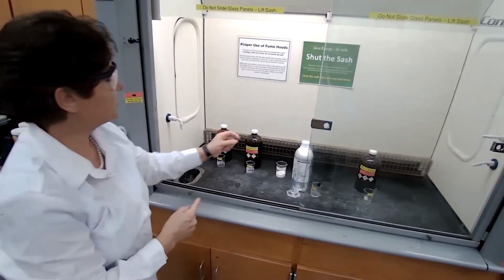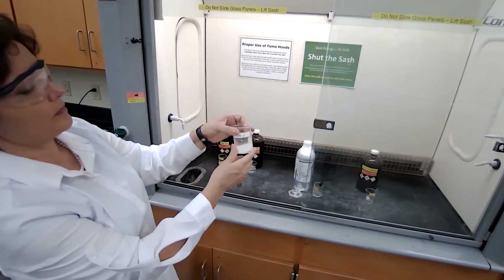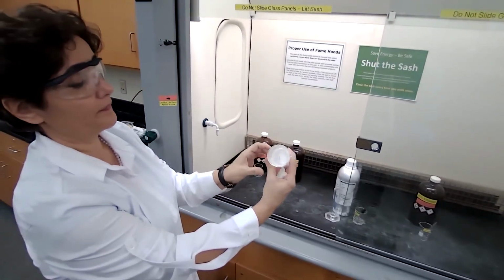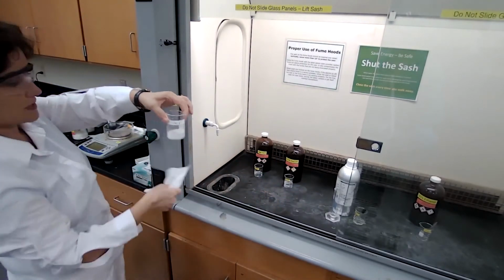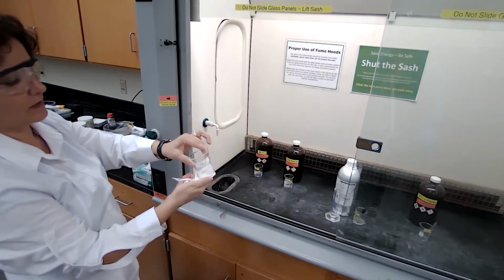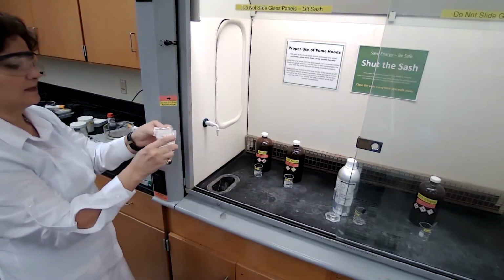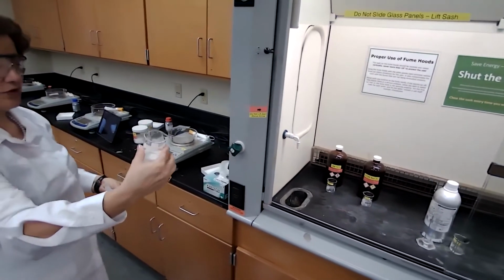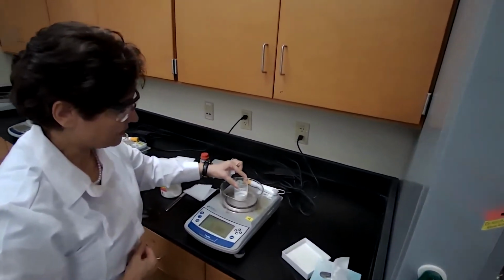Okay, back to the flask where we had the sample with the ether. Now, dry. The ether has evaporated. That was nice. Dry the outside of the beaker, because of the evaporation the outside sweats and is moist. Dry the outside, then measure the sample.